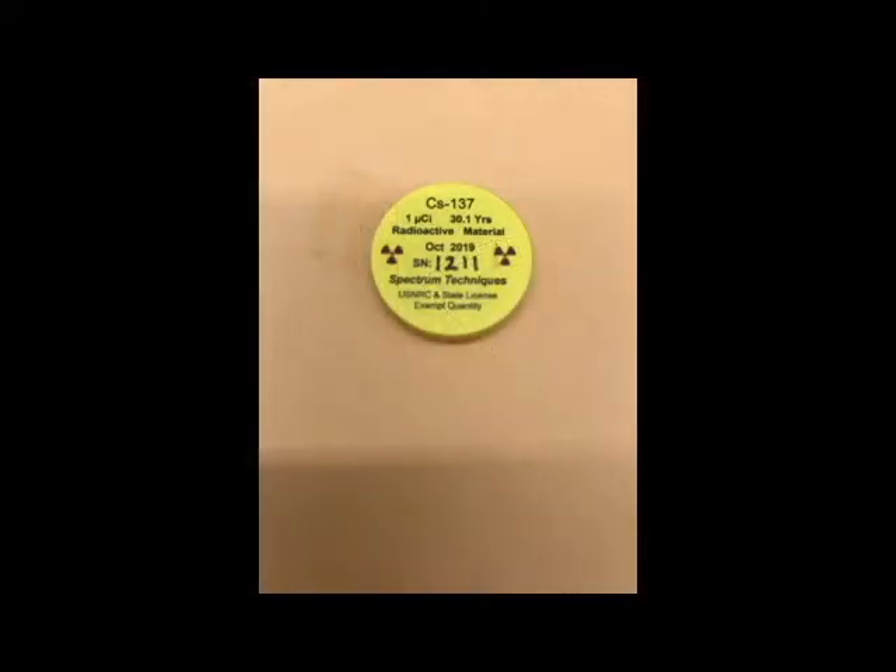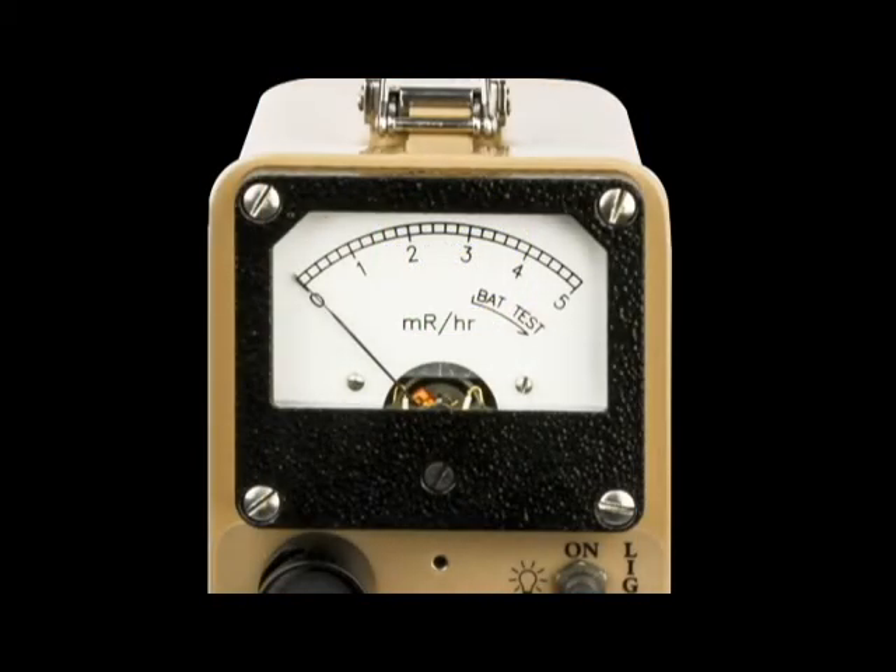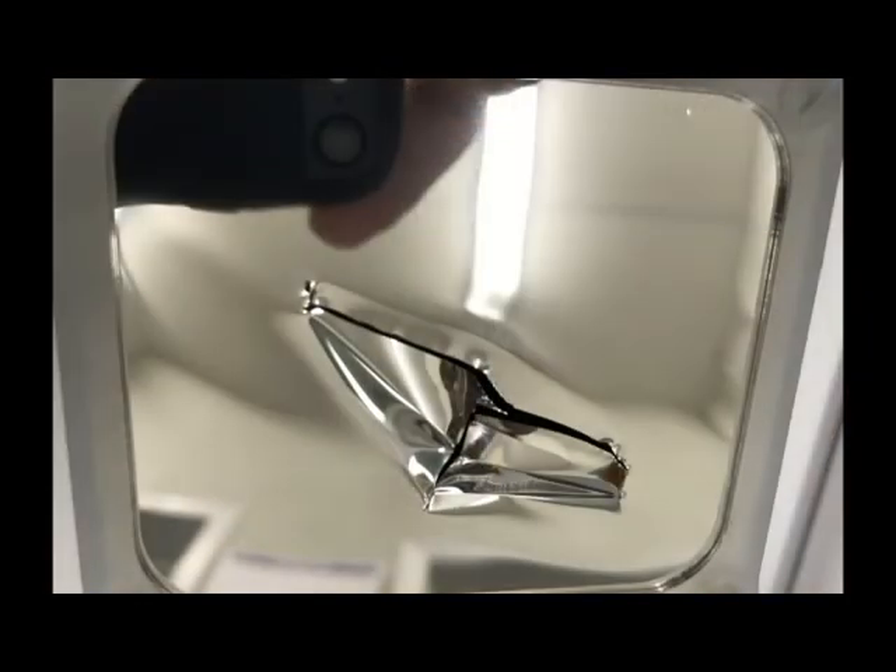Ludlum Measurements offers a 1 microcurie cesium-137 source for sale that can be used as a check source. A source this size is called an exempt quantity, and as such it is exempt from NRC regulations to possess, use, transfer, dispose, or ship. To perform the operational test, first ensure that the meter is properly zeroed. Open the beta shield, but be careful — when the beta slide is open, the Mylar window is fragile and may be damaged or punctured quite easily.